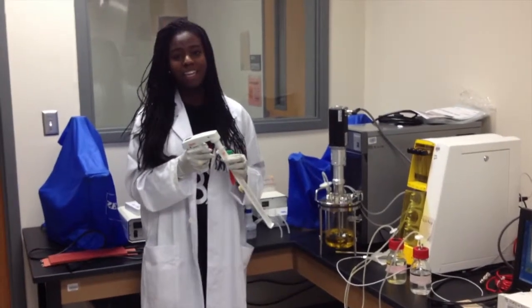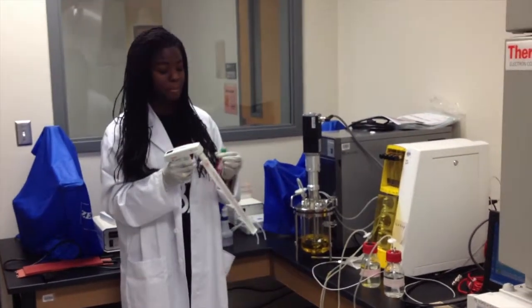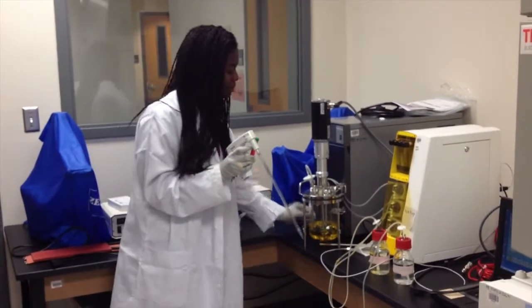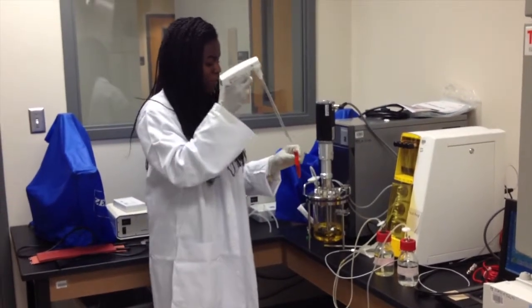So after pouring our media into the vessel, we're going to use our pre-inoculum and inoculate our media. Using a serological pipette, pipette a certain amount.